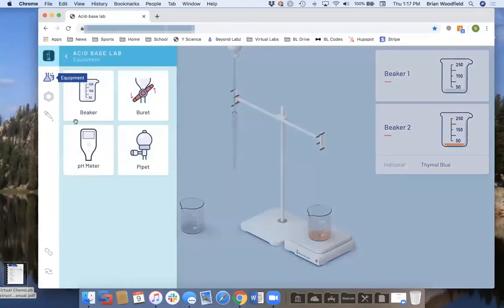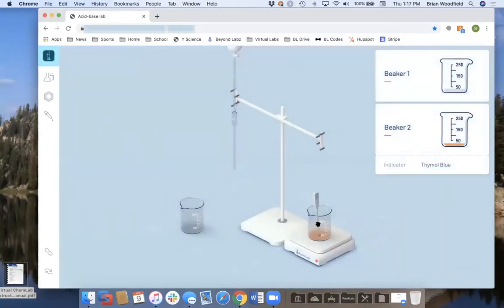So, we have a pH meter here. We don't have a conductivity meter. You notice we don't have a balance yet. So this is where we're going. It's a bandwidth issue. Unless you think we're getting rich off of anybody, all of this revenue gets funneled right back into development for these new things. And I think what we've decided is that we're going to break this movement into HTML5 into 2 stages.